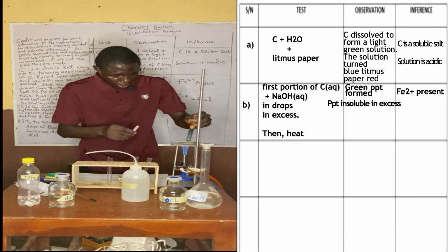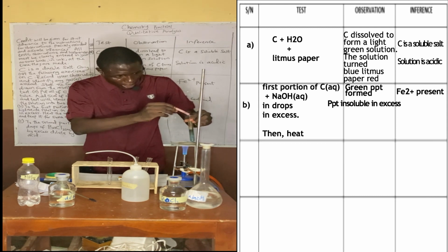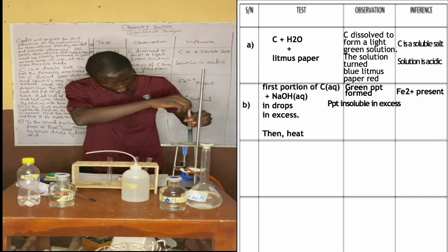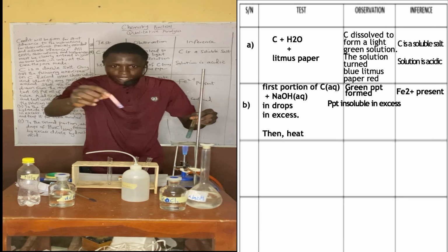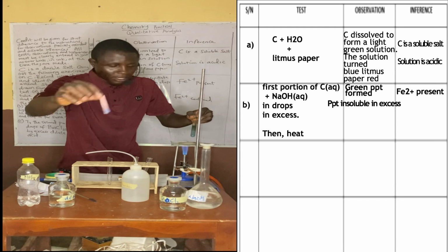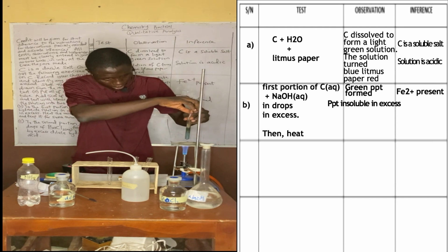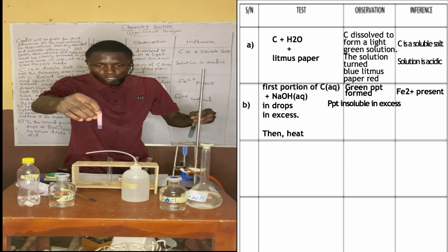So when you heat it, let's place this one here. This red litmus paper, I'm using red litmus. Let's see what happens to red litmus paper. You can see, look at this, the red litmus paper has been turned to blue. Look at this on heating. You can see the red litmus paper turn blue.